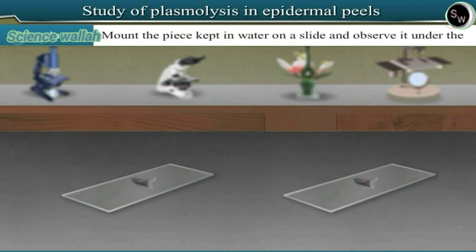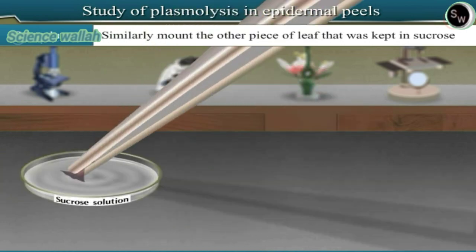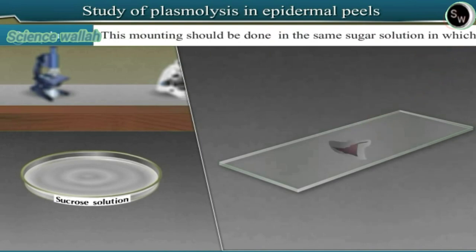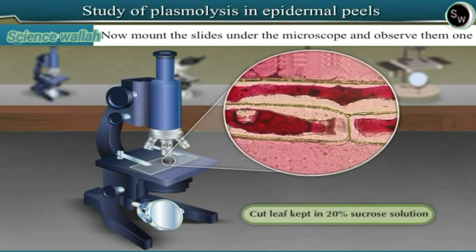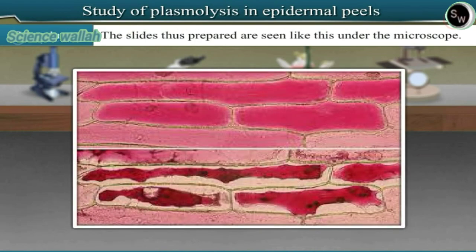Mount the piece kept in water on a slide and observe it under the microscope. Similarly, mount the other piece of leaf that was kept in sucrose solution. This mounting should be done in the same sugar solution in which it was kept in the Petri dish. Now mount the slides under the microscope and observe them one by one. The slides thus prepared are seen like this under the microscope.